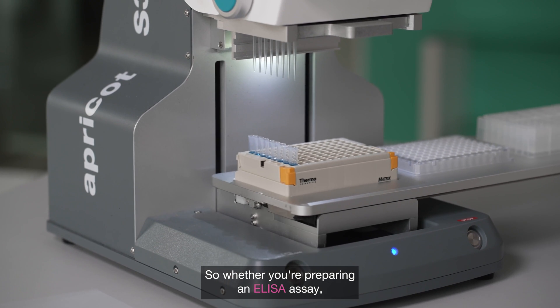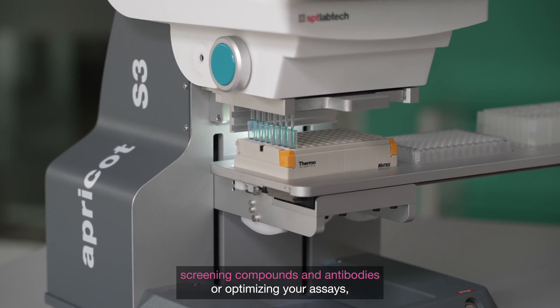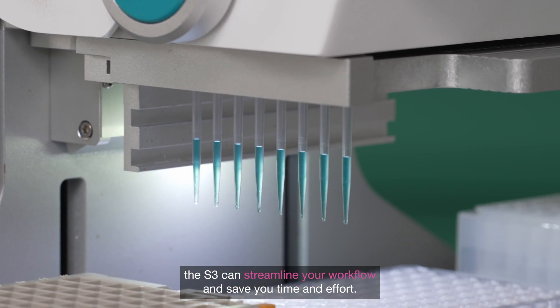So whether you're preparing an ELISA assay, screening compounds and antibodies, or optimizing your assays, the S3 can streamline your workflow and save you time and effort.